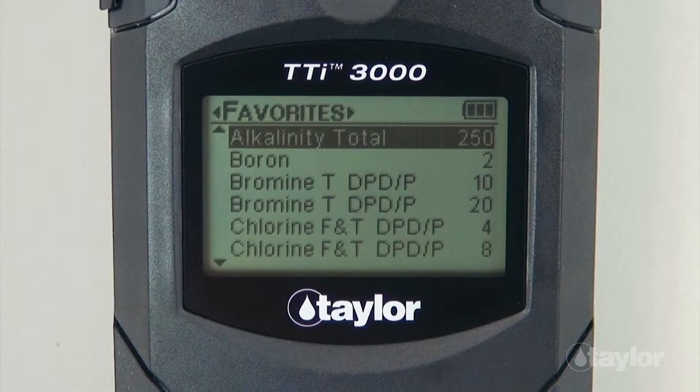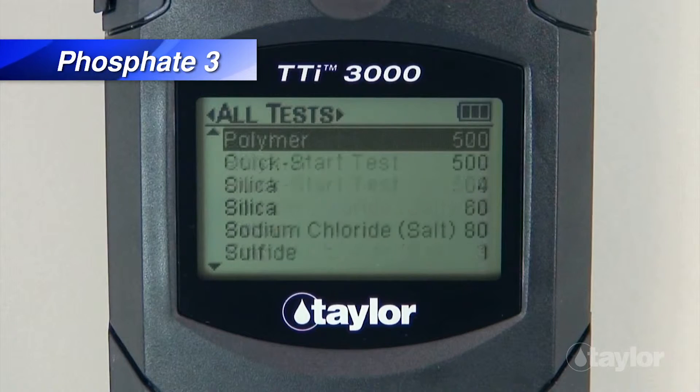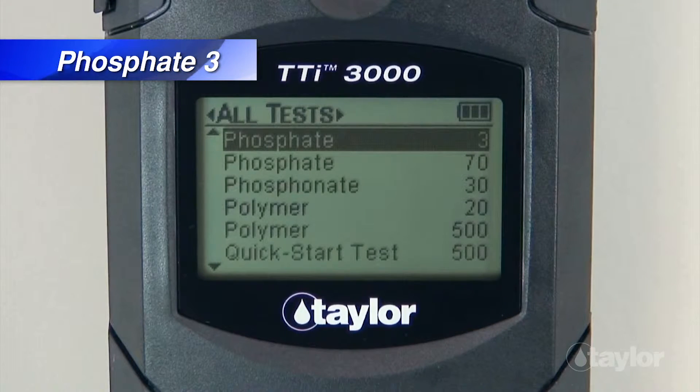For this demonstration, we will select Phosphate-3 from the All Test menu, which contains a list of pre-programmed Taylor tests. If you have added the Phosphate-3 test to your Favorites menu, it can be found there also, or in the Recent Tests menu if it's a test you have performed within your last 10 procedures. Scroll up or down to locate the Phosphate-3 test, then press Enter.